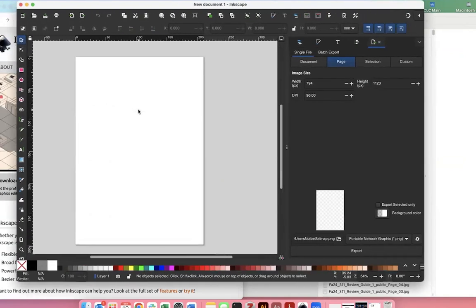What's really nice about Inkscape is it looks really intimidating, but when you scroll over something, it tells you what you can do. Right now I'm on this arrow tool, the select tool, and it tells me that I can get that with an S as well. The other tool we're going to use a lot is this T, the text tool. So you can press T or you can come over here to get the text tool, and this is going to allow us to label our lanes.